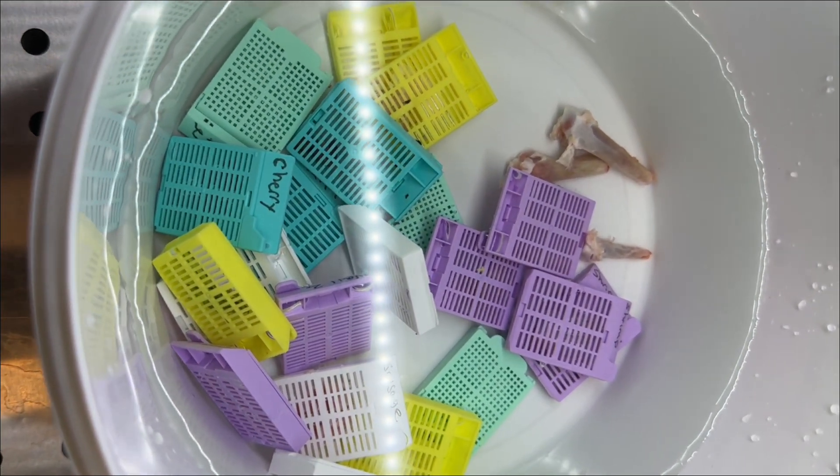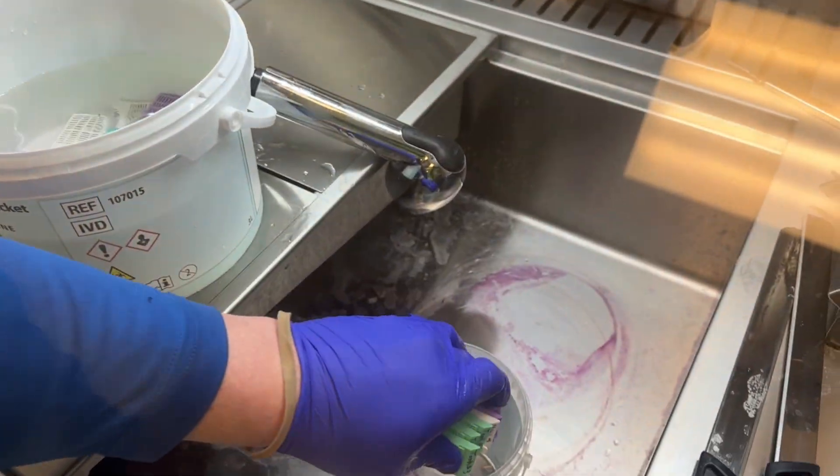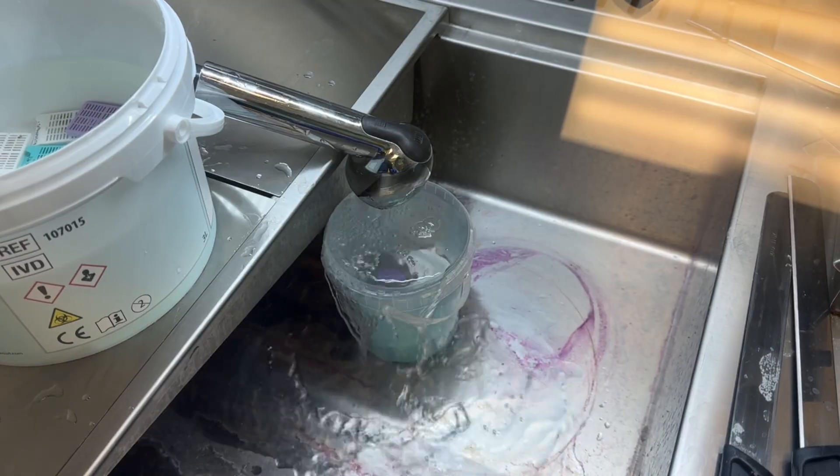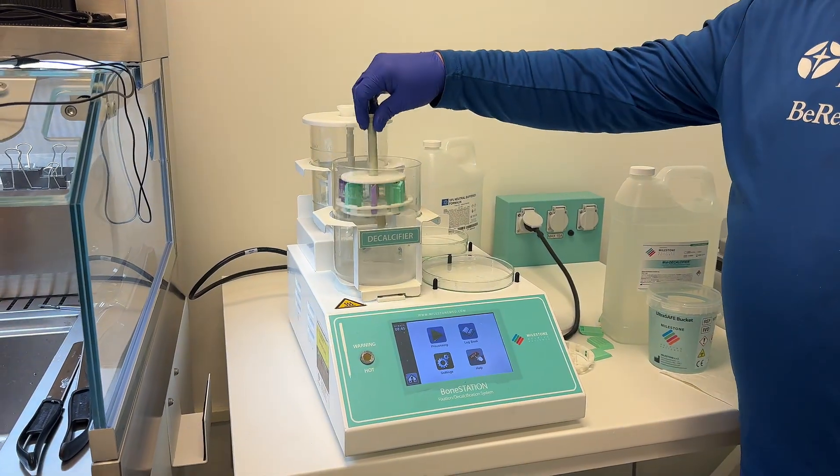After grossing, we fixed the specimens in formalin overnight. This step is essential to preserve the tissue structure and prevent damage during processing. Once fixation was complete, we rinsed the cassettes in water for about five minutes. The lotion, Nair, and untreated samples then moved on to processing right away.